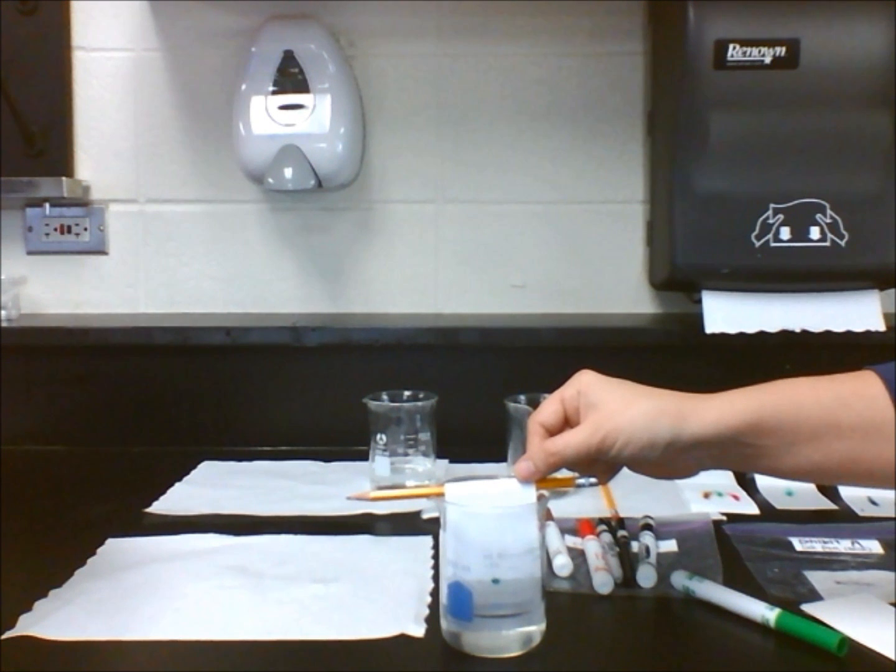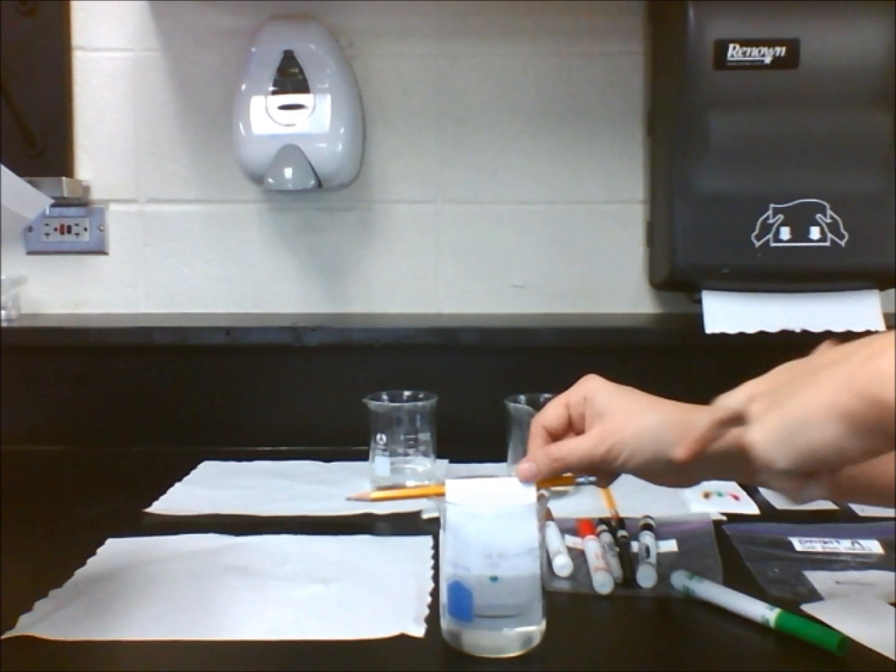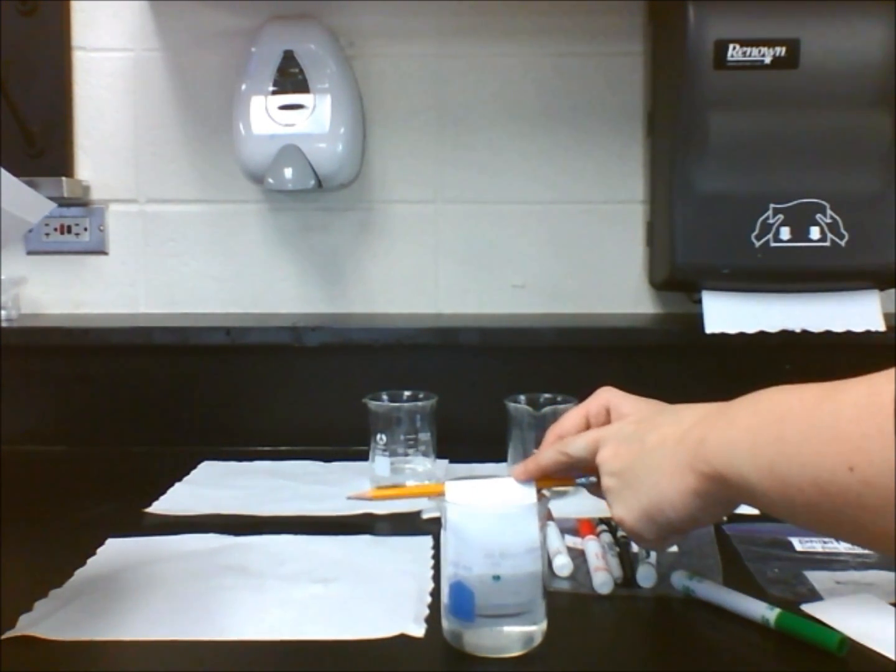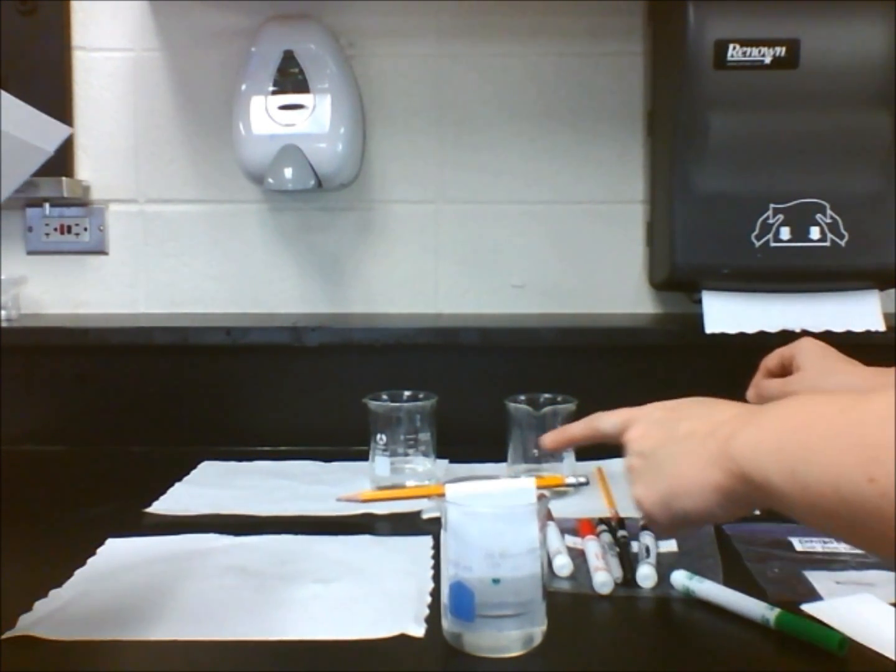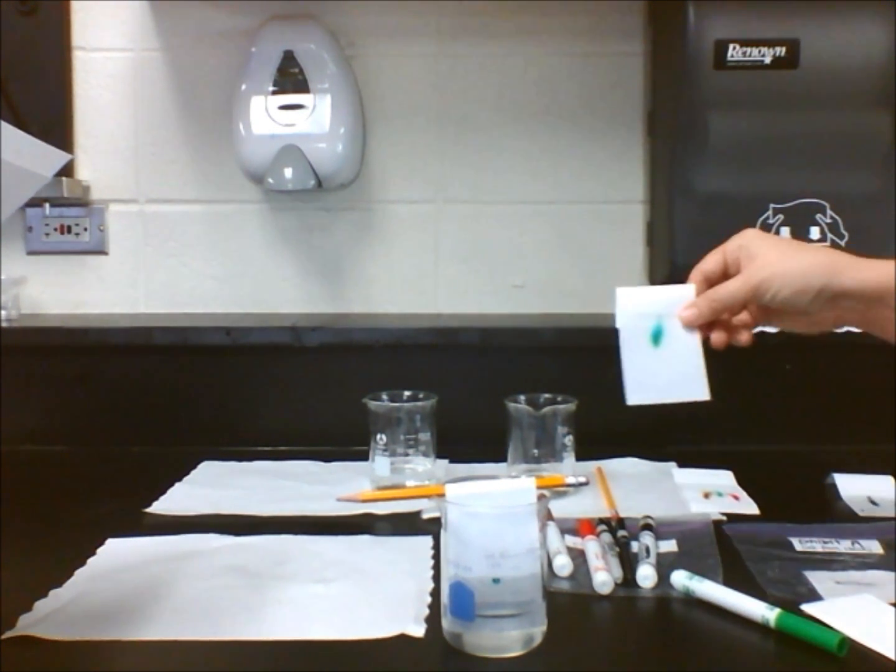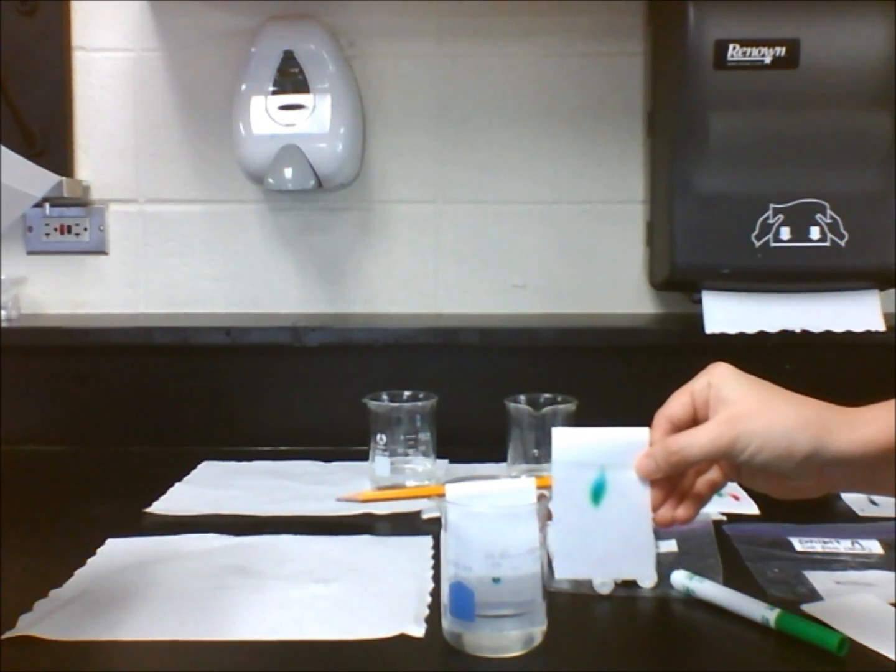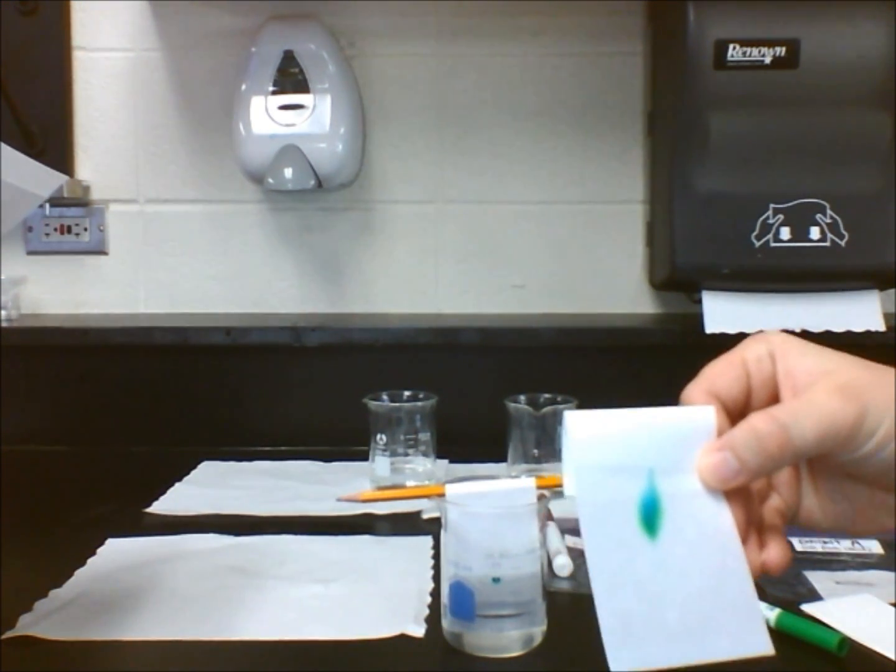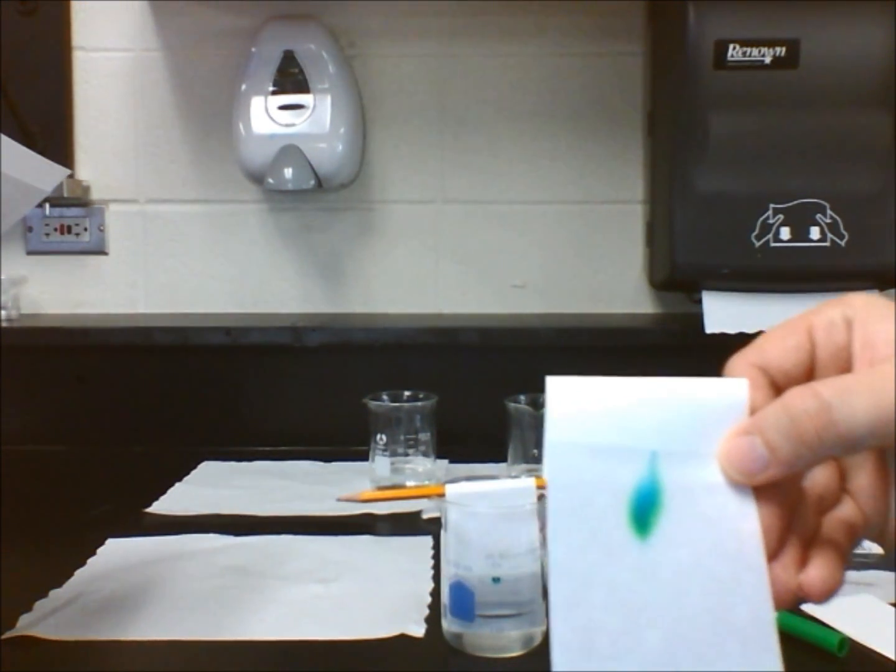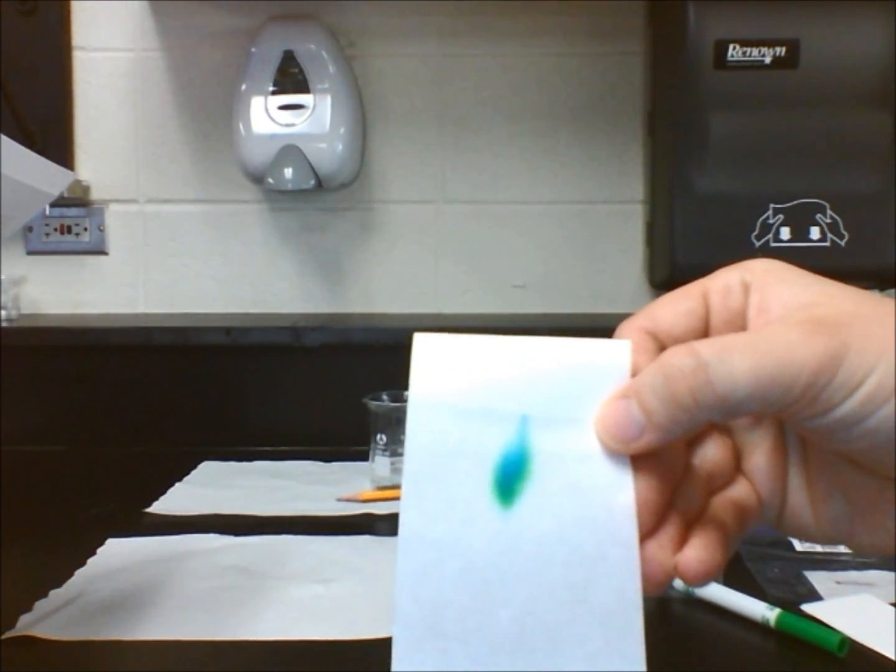After a few minutes, you will notice something happening to the green ink spot. The spot has moved up from the bottom of the paper. You will also notice a couple new colors on the chromatography paper. There is blue ink at the top and a little bit of yellow ink at the bottom.